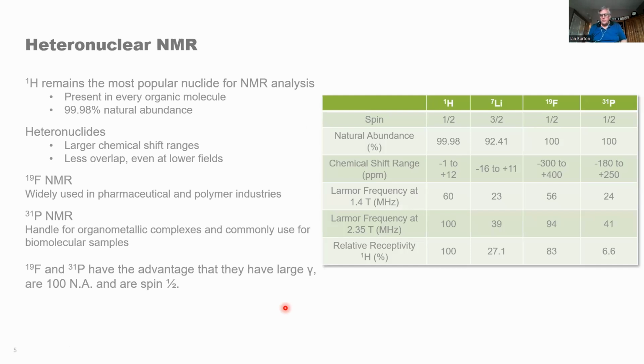So proton NMR isn't the only thing we can do quantitation on. We've seen examples of C13. Other nuclei like fluorine and phosphorus have advantages in that they have a broad chemical shift range, or excellent dispersion. With a complex mixture like a lignin or foods or extracts of botanicals, things like that, the proton spectra can be extremely crowded, and it's very difficult to get clean integrals, even when you do things like deconvolution.